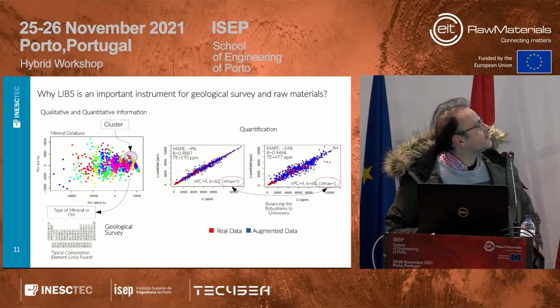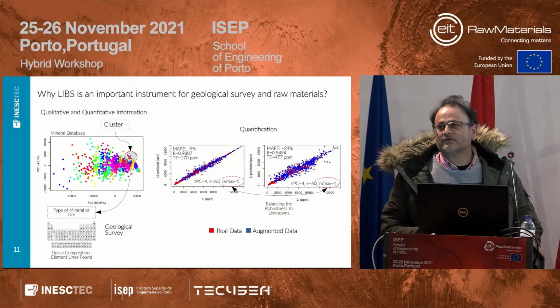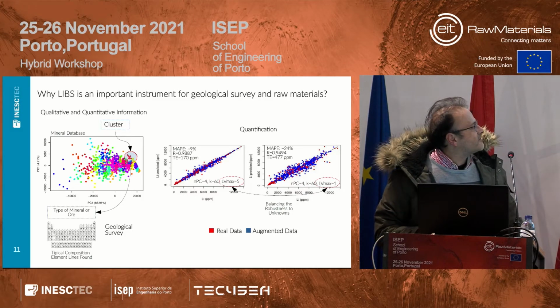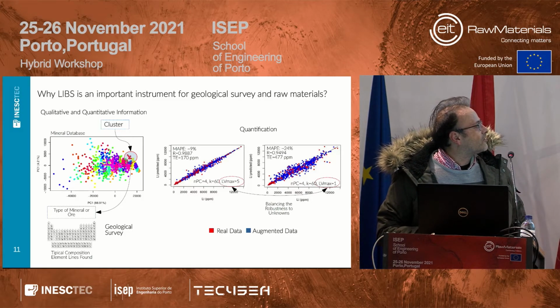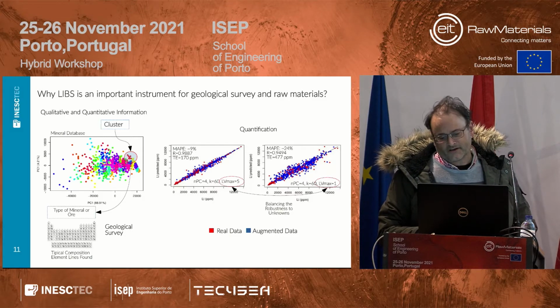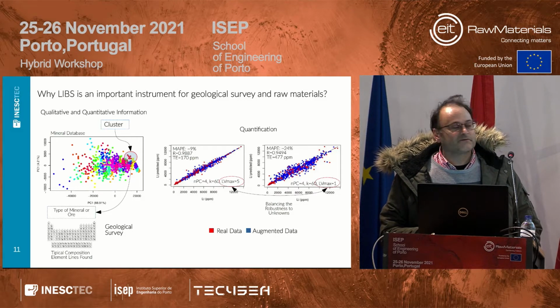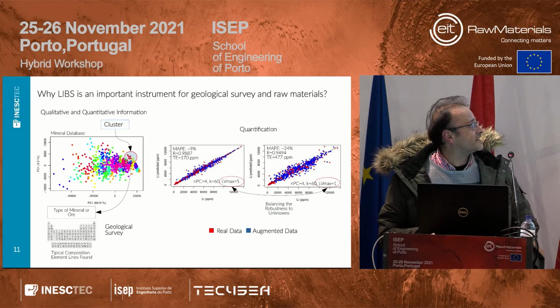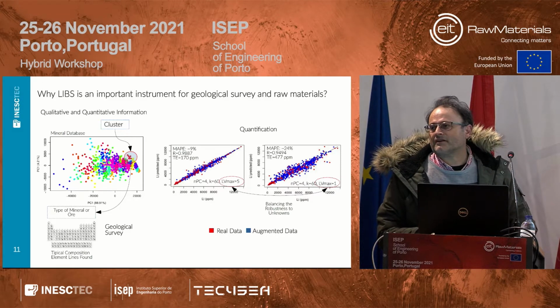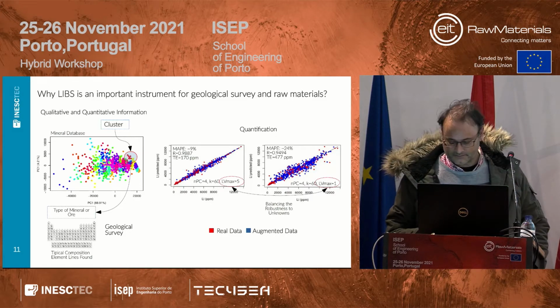But in another way, we can also do classification, and try to understand what kind of minerals are in the sample. And from this type of mineral or ore, we can understand the typical composition. And for those, as you've seen, for these portable LIBS systems, this is like an intelligent or expert system for telling the user what type of mineral he's looking at.